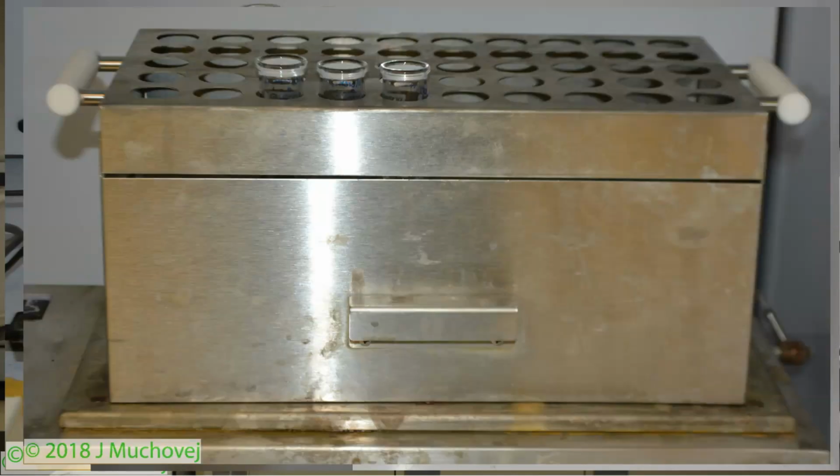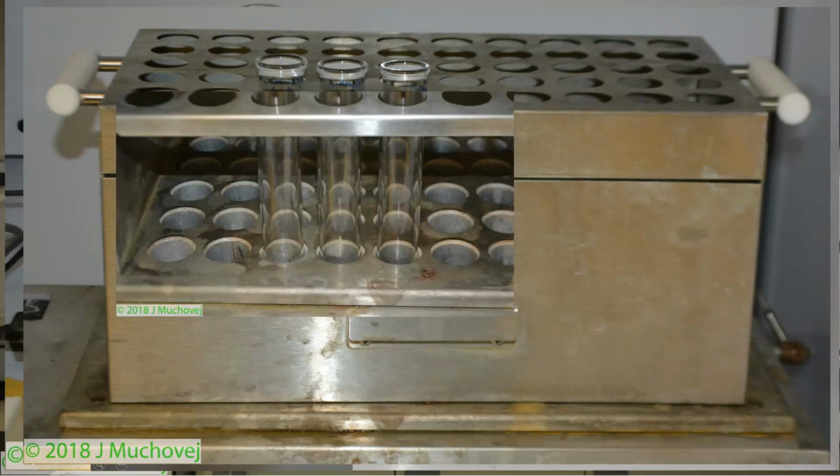You place the holder onto the heating pad. You can see the tubes drop down in height. That's because the other part is inside of the heating element, which means it's getting very hot. It's maintaining it at a constant temperature. If you lift up this little grate on the inside, you can actually see where the tubes are. The tubes extend down into the holes in the heating pad on the basin. That is going to allow for boiling of the material. This is a wet ashing.